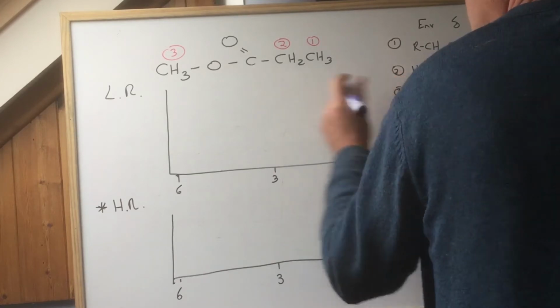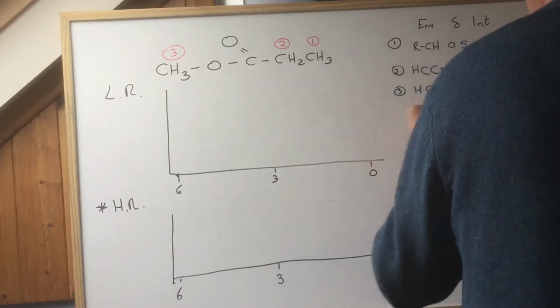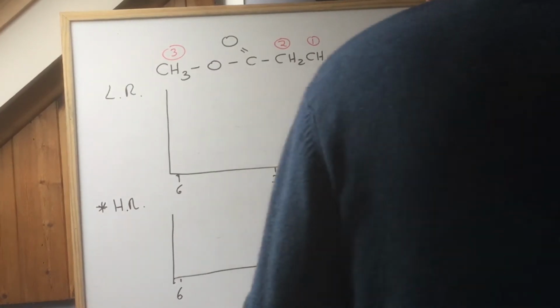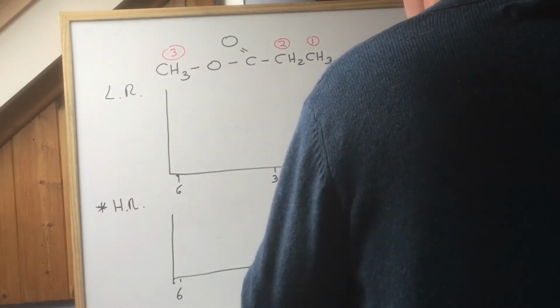H, C, single bond O. Chemical shift 3 to 4, 3 in that environment. There you go. So, armed with that information, I reckon I can do what will essentially be 3 peaks. Okay, so we'll do this.